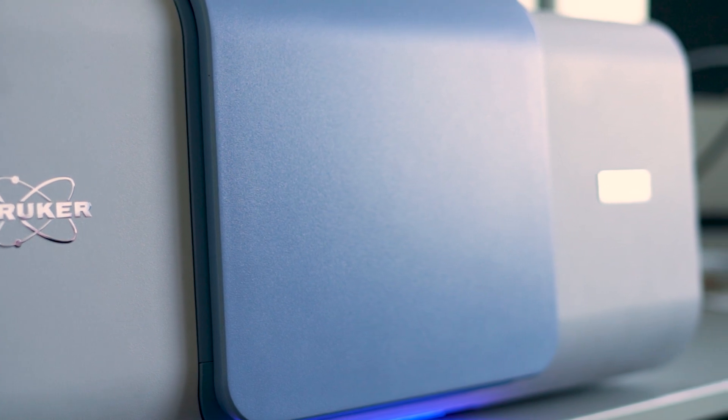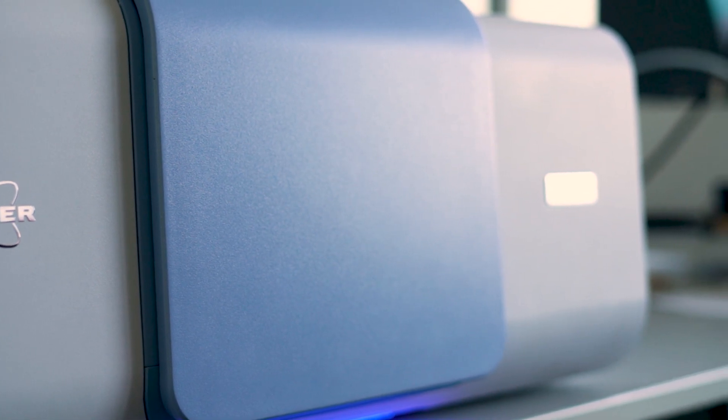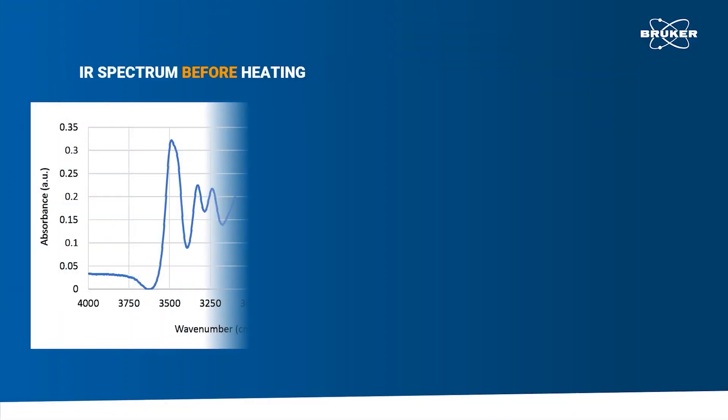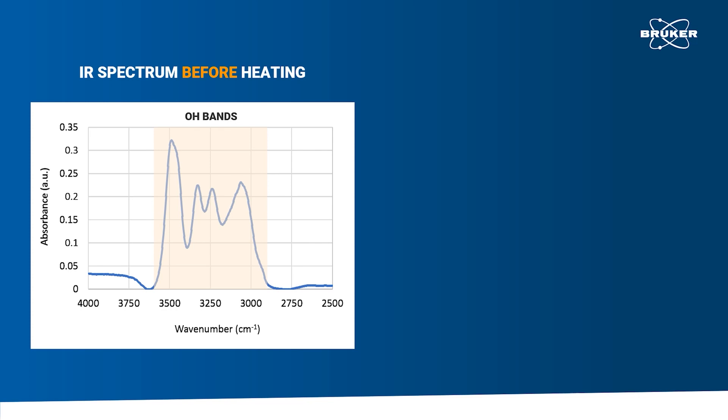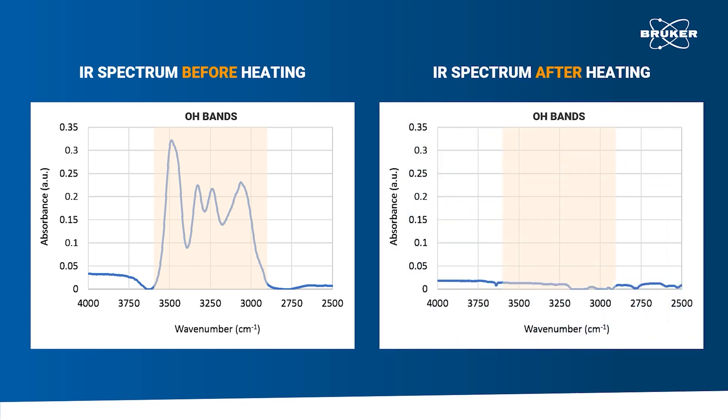Now let's move on to the demonstration. We expect the calcium oxalate hydrate to lose its crystalline-bound water when heated up to temperatures above 100 degrees C. As a result, the corresponding absorption bands of the OH groups at around 3,300 wavenumbers in the IR spectrum should decrease during the heating process. A look at the IR spectra before and after the heating process clearly shows the decrease of the absorption signal in the expected range.